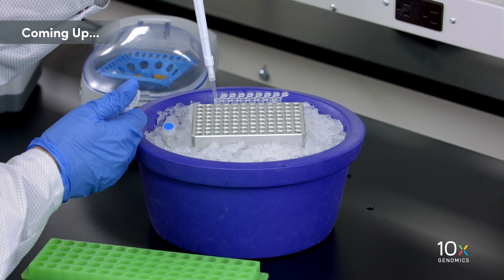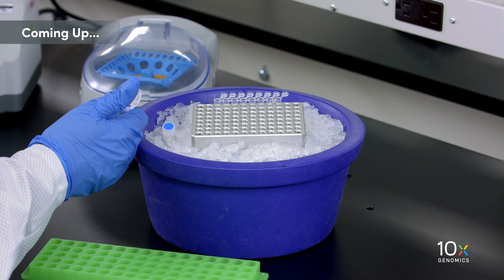We have all of our reagent kits ready. Next, we are going to prepare the master mix.